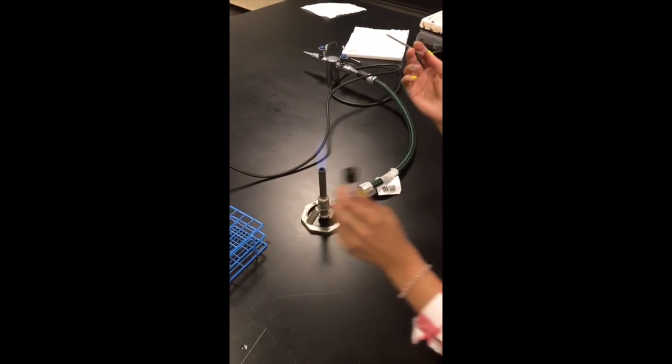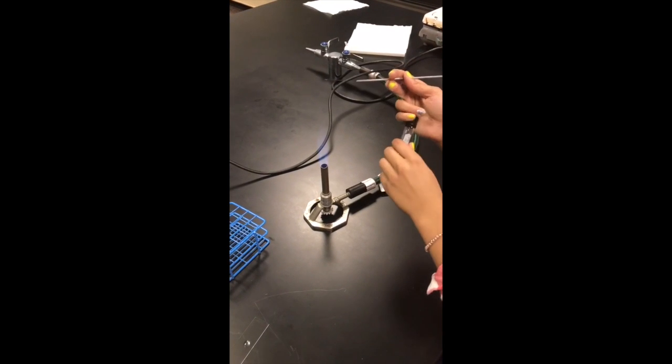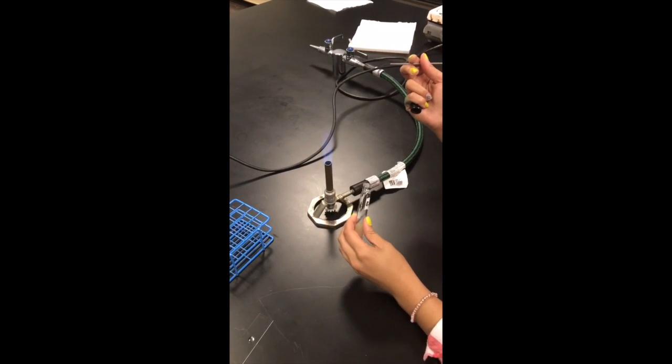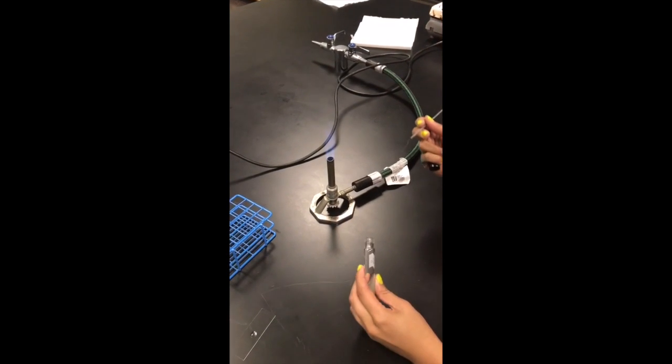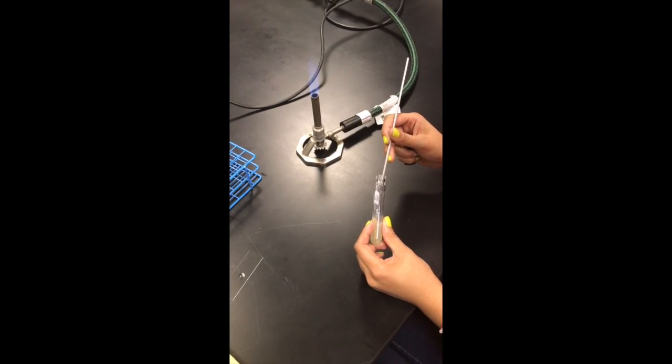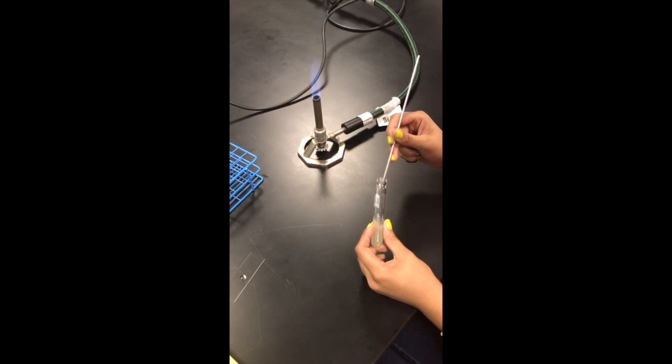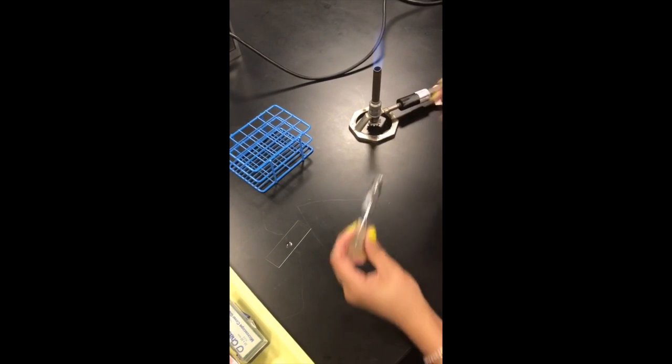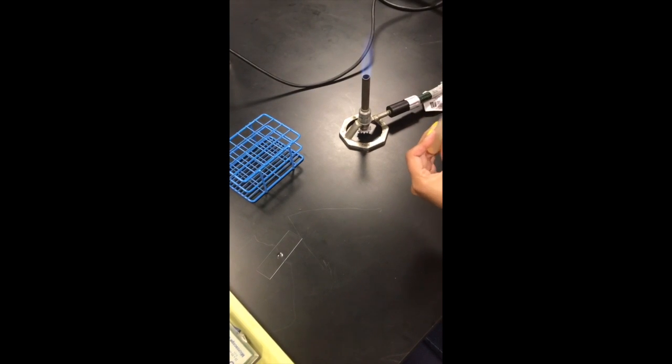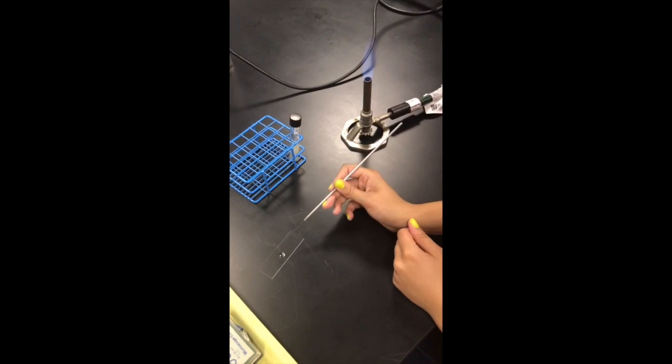You're going to let it sit for about 30 seconds. Take your bacteria, flame open, get some bacteria on your inoculating loop, and flame closed. Put the cap back on.